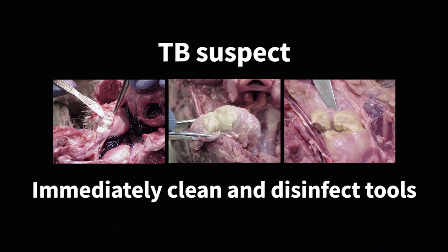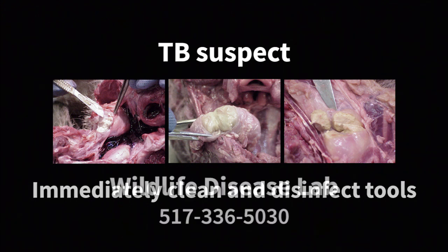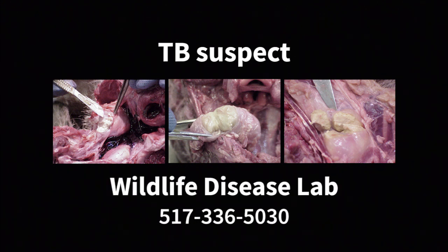While removing the lymph node, if you cut into the node or other tissue that is filled with pus, please stop cutting and double-bag the entire head. This deer could be a TB suspect. Contact the Wildlife Disease Lab at 517-336-5030 for further instruction.